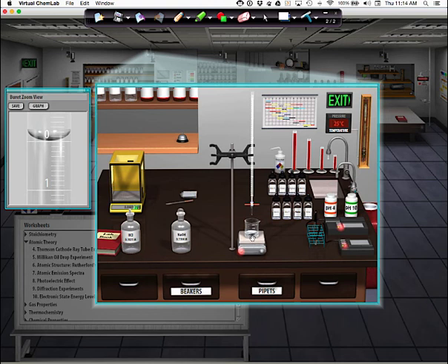There's nothing that would tell you that you successfully put the indicator in the beaker except for one subtle thing changed. Do you see it? All of the other indicator labels grayed out. If you understand the idea of graying something out, it means it's no longer an option on a computer. So guys, all of these grayed out, and that one did not, telling you that you successfully added the phenolphthalein. All right, so now here we go. So we are now done with step 15.